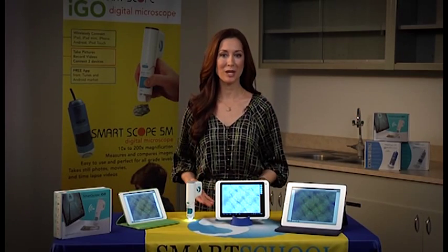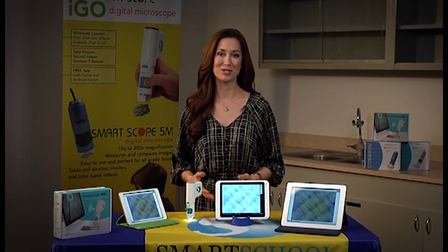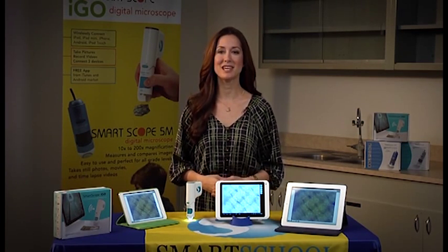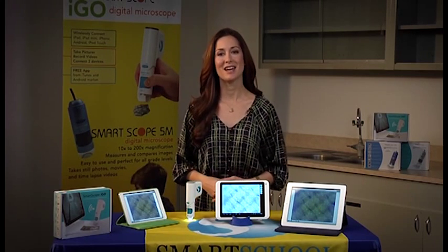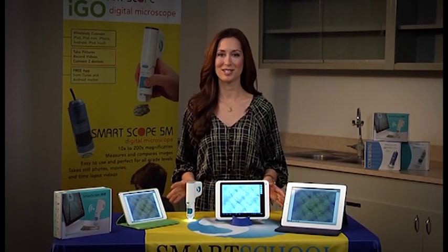Hi, I'm Shannon, here to give you a quick overview of the new SmartScope iGo. This is the newest addition to the SmartScope family, and what makes the iGo unique is that it's wireless, so it can connect to up to three mobile devices, such as tablets and phones, all at the same time.